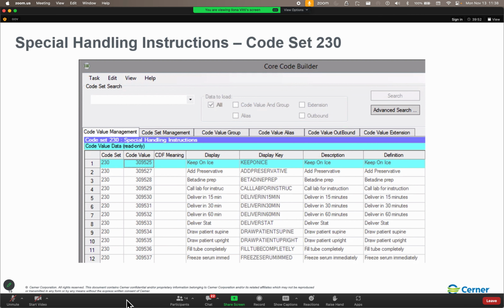So with Bedrock up here, in fact, I can go ahead and shift this off to the side so that we've got a better angle here. So in Bedrock, when you build a collection class, you don't have the max class volume, you don't have the max accession size, you don't have the default storage date and time, you don't have the barcode format, again, code 128, code 39 with check digit, code 39 without check digit, you don't have that at all.